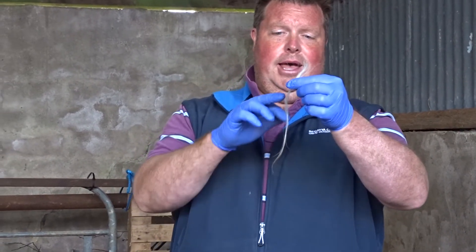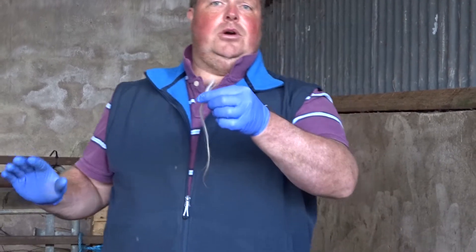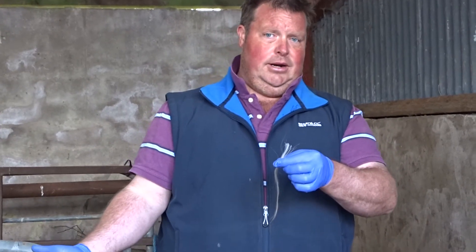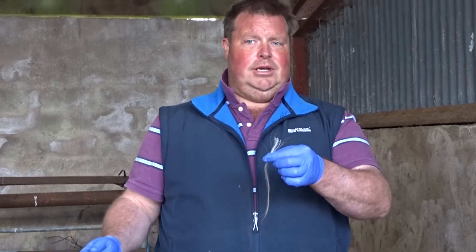Down here there may be a little dirt — I don't mind cutting it off. Cut hair from the animal is absolutely useless; there's no point in cutting the hair out of the animal. I want to make that clear: the root follicles are what's important.